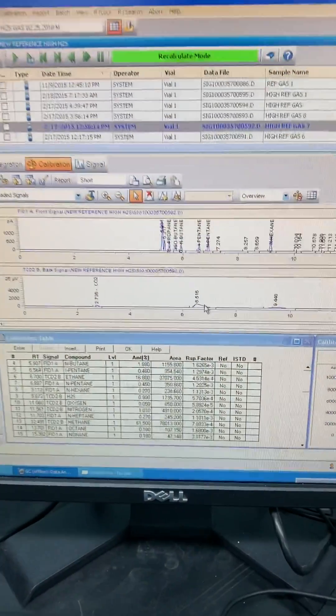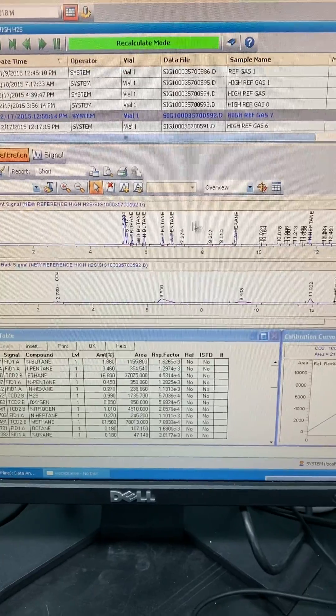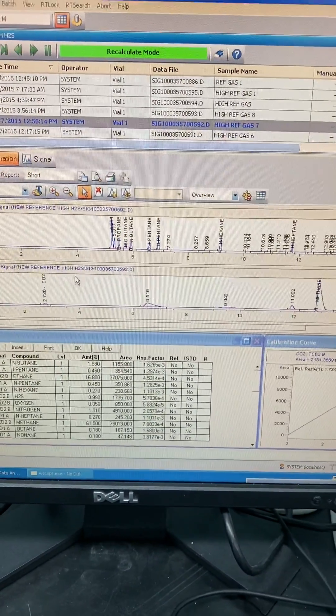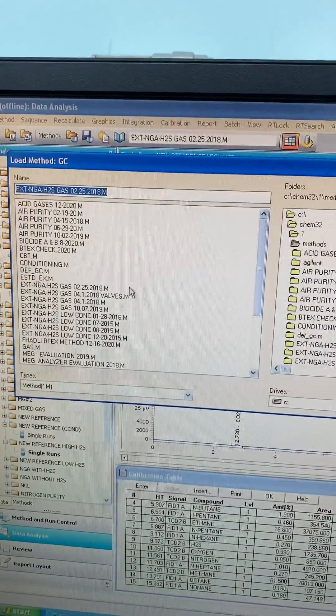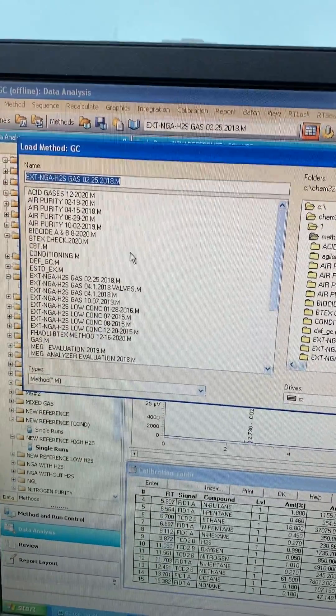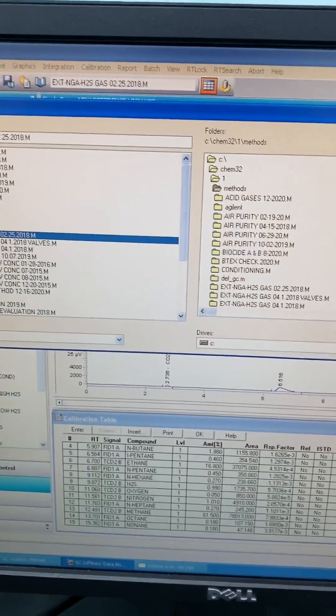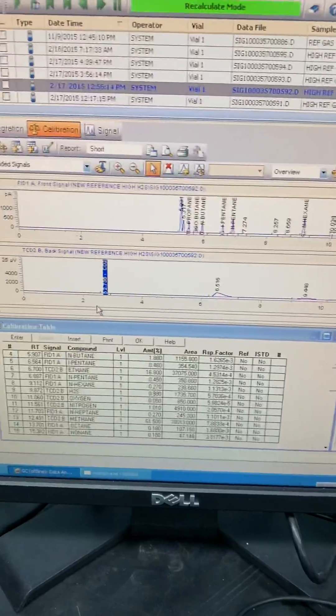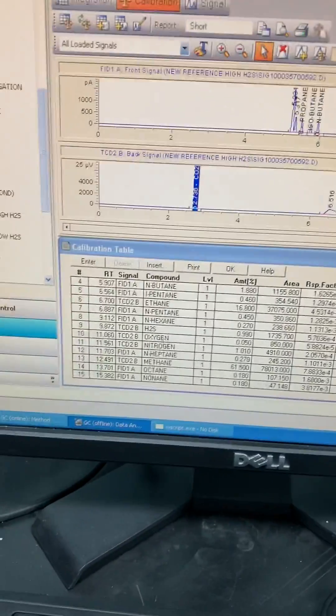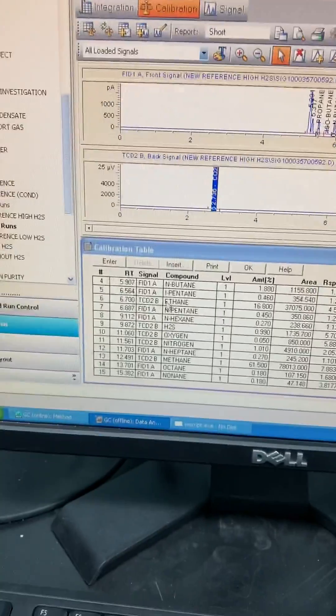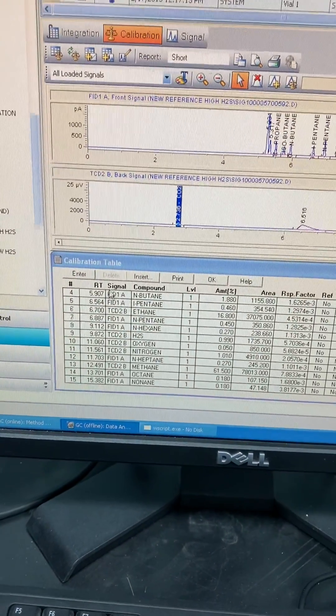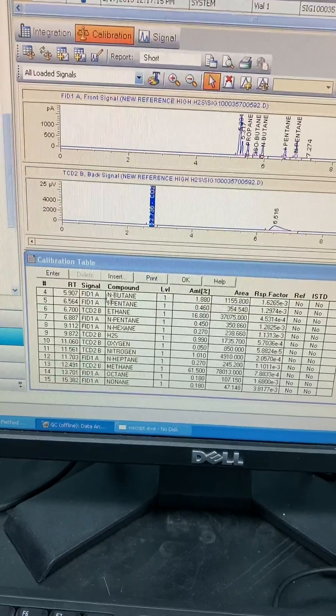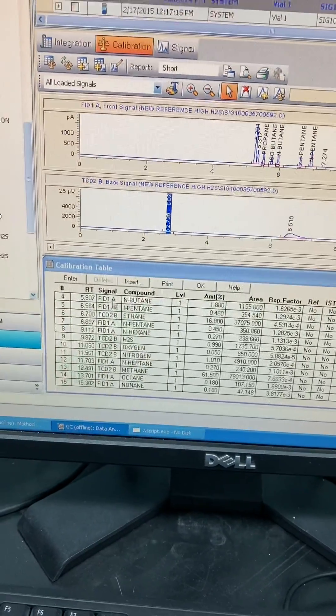First of all, once you open the software and open this run to compare, you have to open the method that you want to reintegrate or do calibration. We will choose this method as example. As per this method, in the calibration section, you will see the table having the signal for like normal butane will be detected by the FID detector.